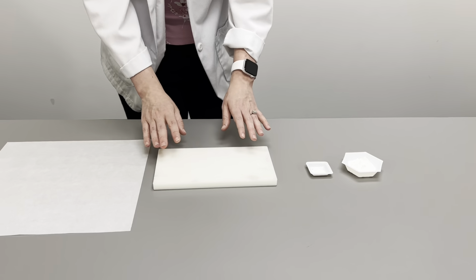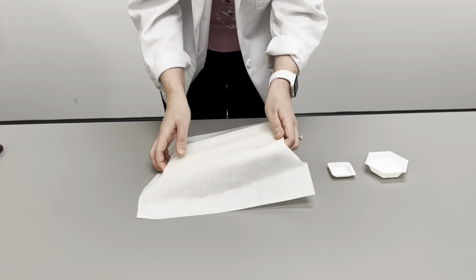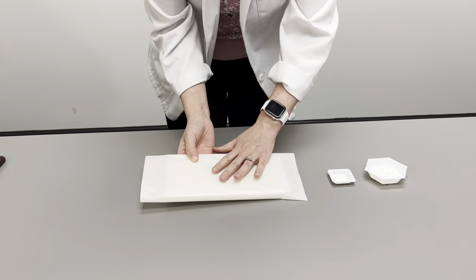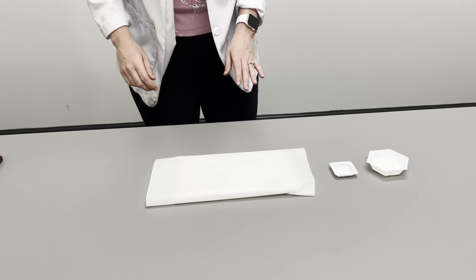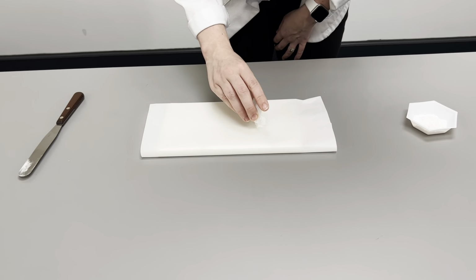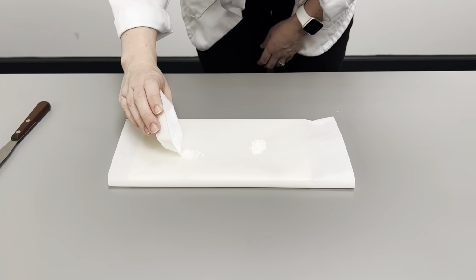So you never put anything directly on your compounding slab. Instead, you will take your wax paper and fold it underneath the slab to keep it in place. Once your wax paper is secured, you take your small portion of drug and put it on one side. And then your filler and put it on the other side.